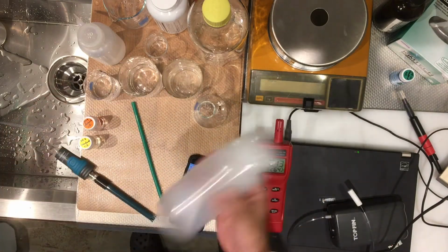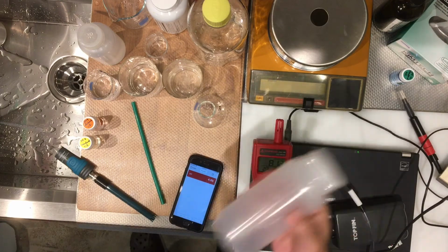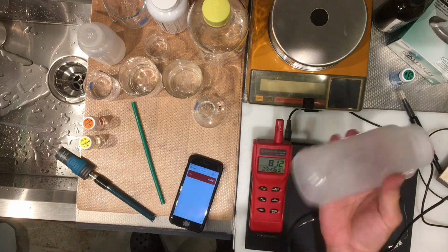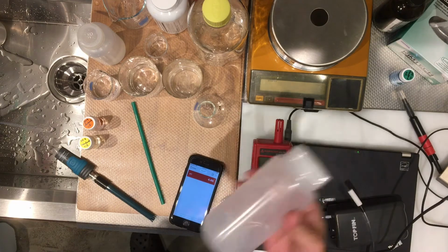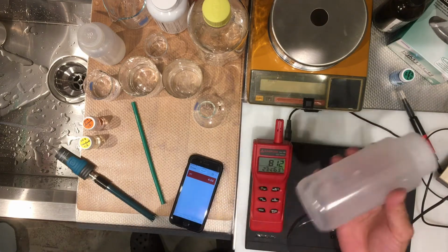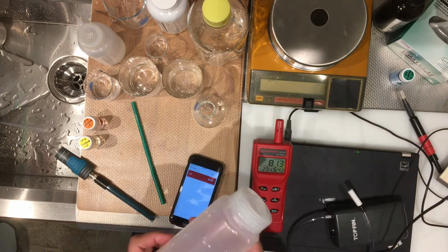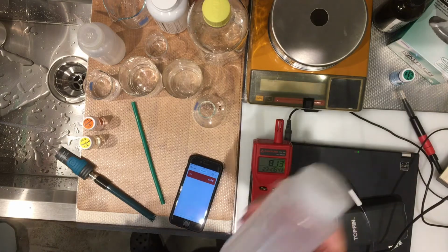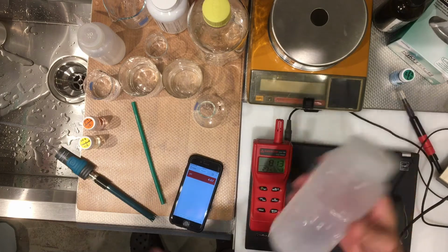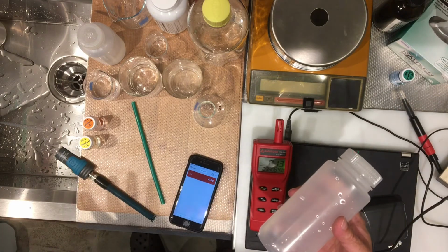So I fill this with my exhale, and now I'm shaking it. The shaking is necessary because it mixes the air with the water, so it gives carbon dioxide a chance to dissolve in the water. And as you know, when carbon dioxide dissolves in water, you form carbonic acid, and carbonic acid makes the water more acidic. So the pH of this water should be lower than the pH of when water was in contact with the air that I showed you earlier.